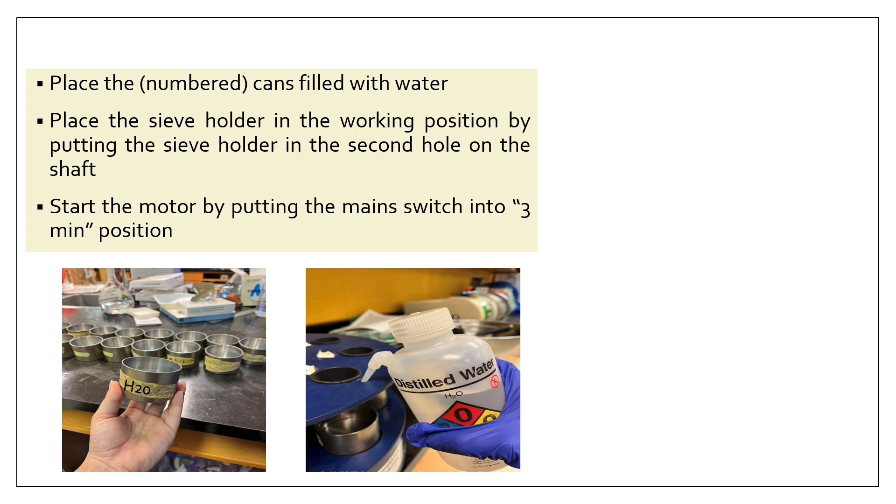Now place the sieve holder in the working position by putting the sieve holder in the second hole on the shaft. We can see this in the video. Now start the motor by putting the main switch into 3 minute position.